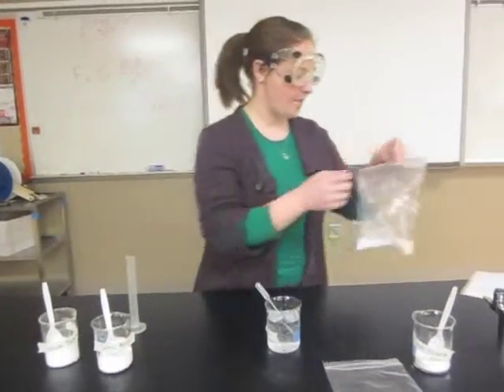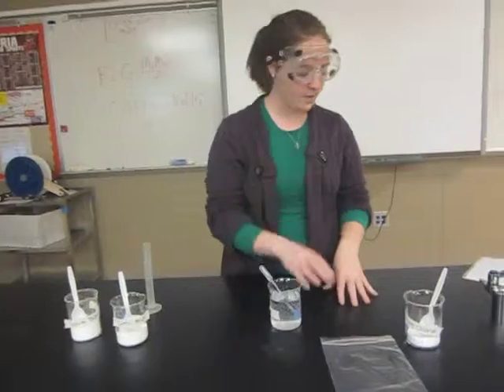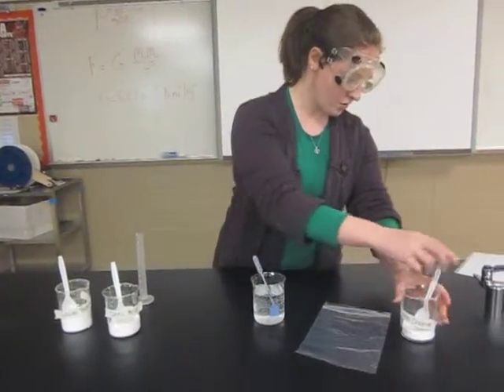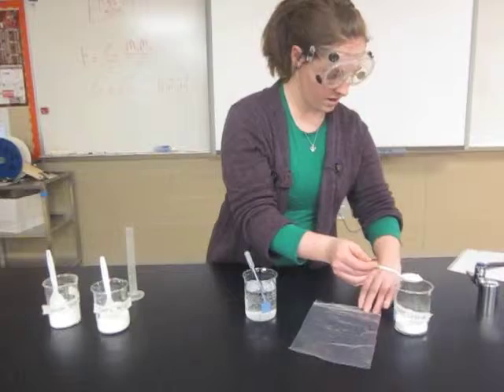Now we're going to do our hot pack. You want to set the reaction that you just did into a sink just to make sure nothing happens to it. Now we're going to do our hot pack. You want to put one scoop of calcium chloride into the plastic bag.